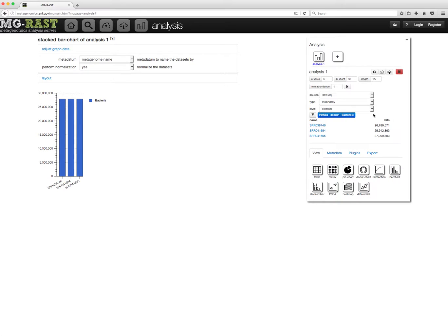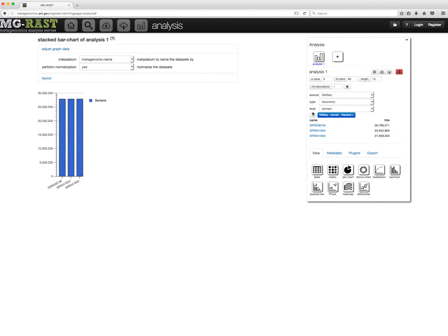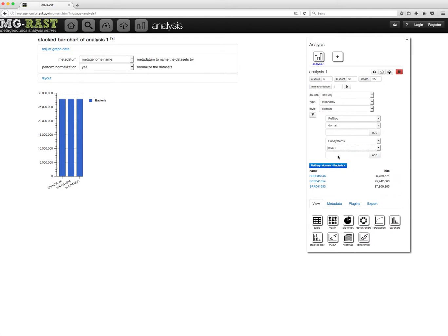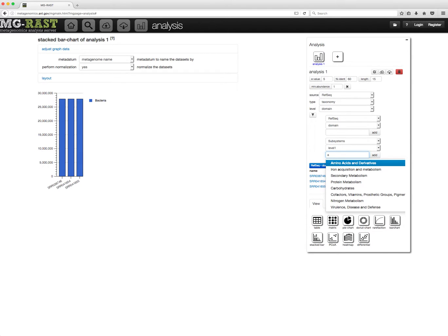Now to slice and dice, you add a functional filter as well. Again, selecting the database, hierarchy level, and search term.